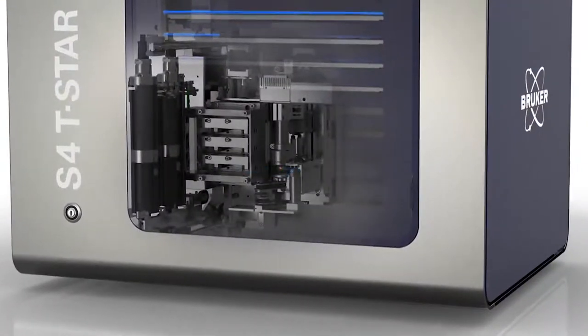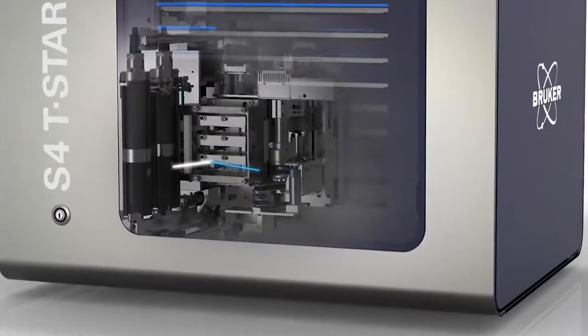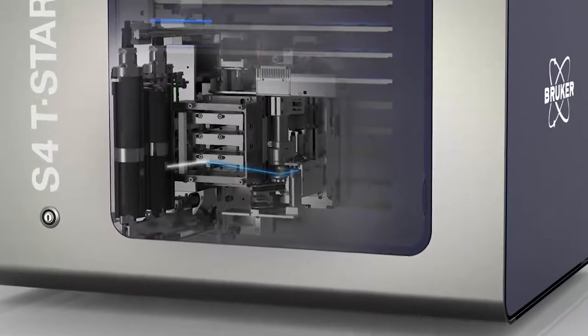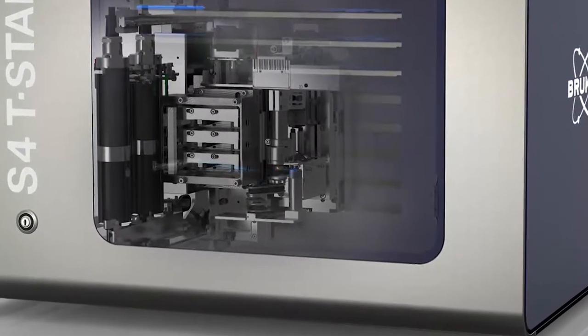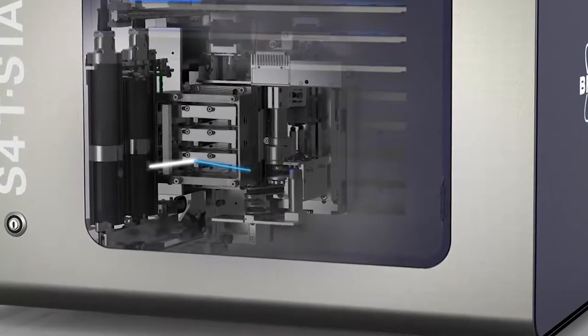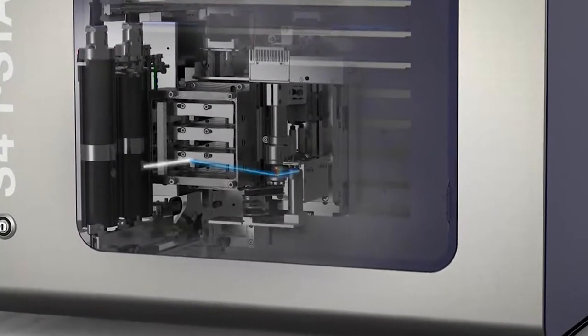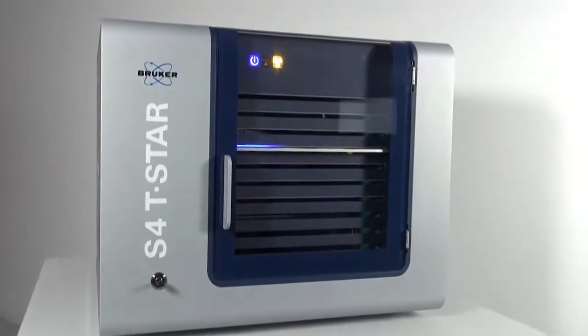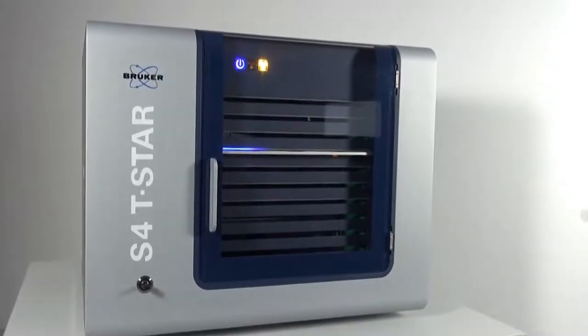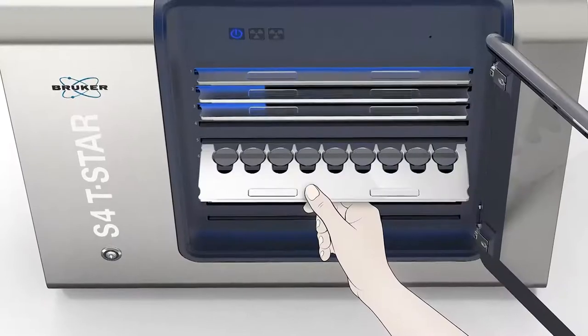The S4 TSTAR uses up to three different excitation modes, the benefit for the user's ultimate sensitivity with detection limits for most elements below one part per billion.